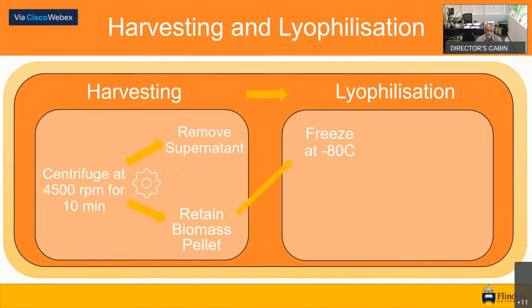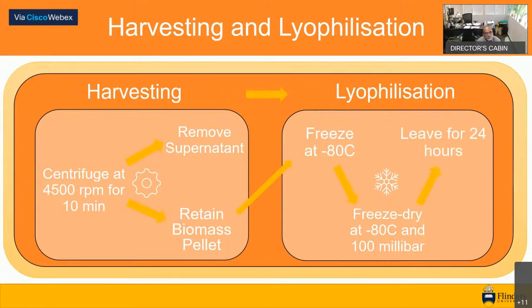Dry biomass allows significantly improved lipid extraction efficiency compared to wet biomass and therefore is frequently used in the laboratory and industry for high lipid yields. However, the eventual development of better extraction procedures is necessary due to the high energy input required in the freeze-drying process, especially if microalgae are to be exploited more widely for commercial fatty acid production.